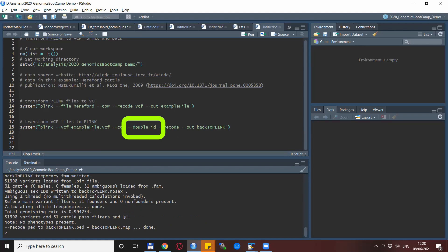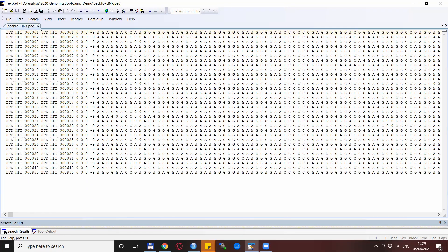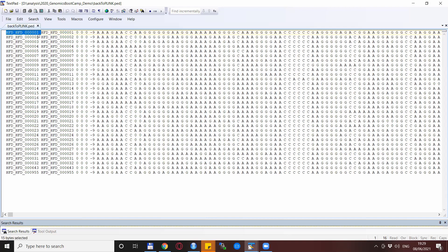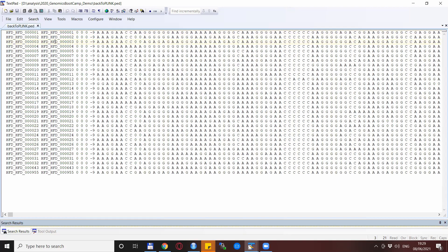So a quick demonstration how to use these. If you include the dash-dash double-ID, it actually copies your ID also in the place of FID. So this is how it looks like. This is back already from the VCF file. So you see that the ID and FID are exactly the same.